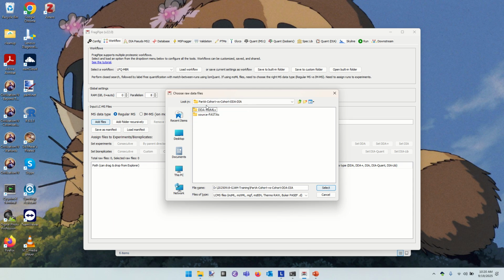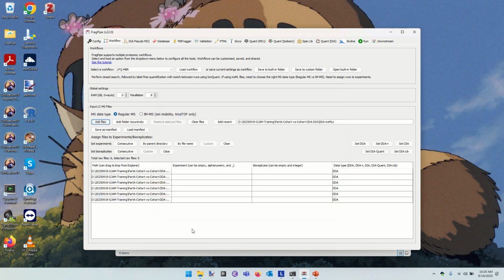Oh, I didn't actually select them? Oh Lord, that's a silly mistake. Okay, yes. So having told it, yes, I actually want the files in that directory, not just to show me the files in that directory, that's good. So now I have these files here.